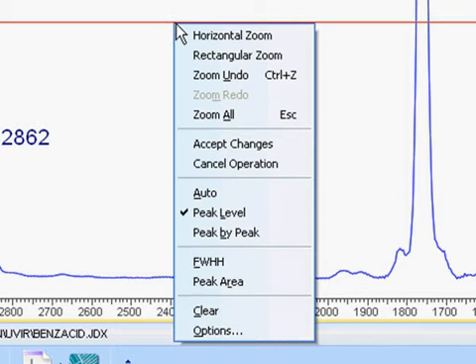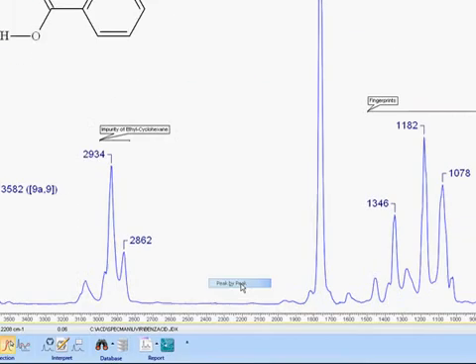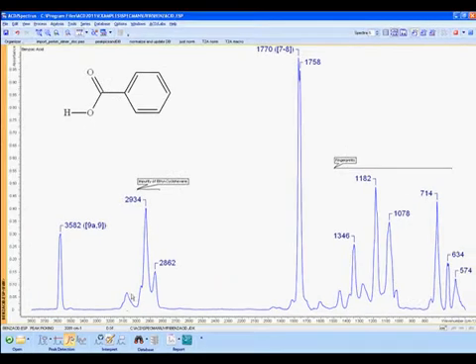We can also pick peaks manually. Rather than going to the Workflow menu, we can right-click and select Peak by Peak, then clicking on a peak to select it, or selecting an existing peak to deselect it.